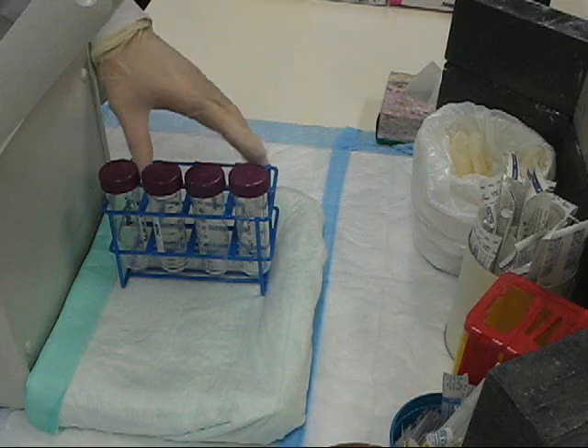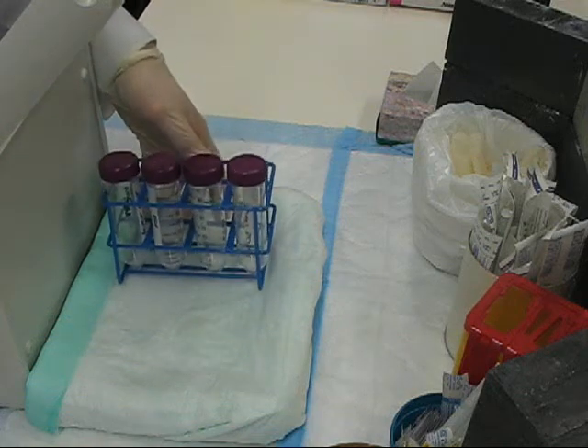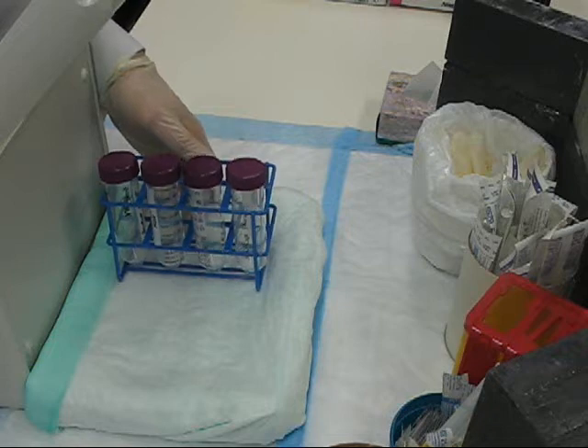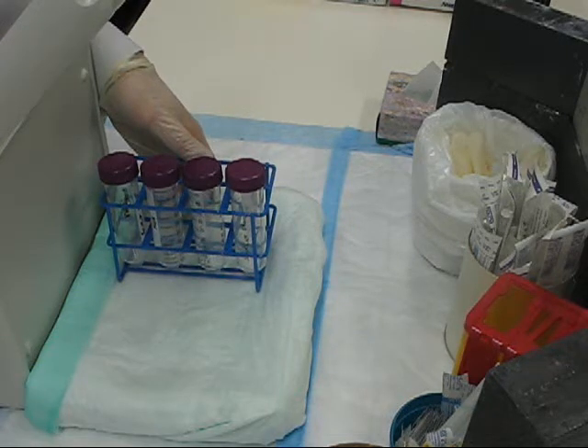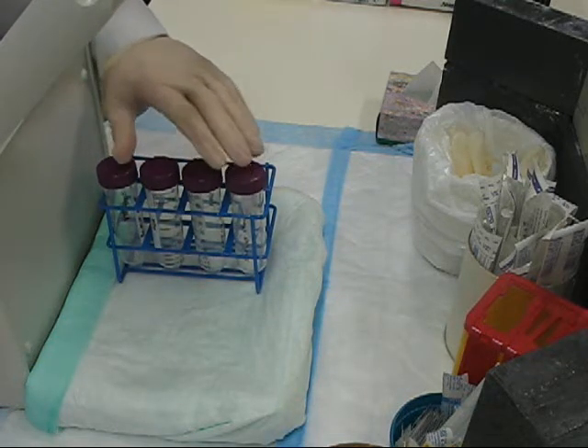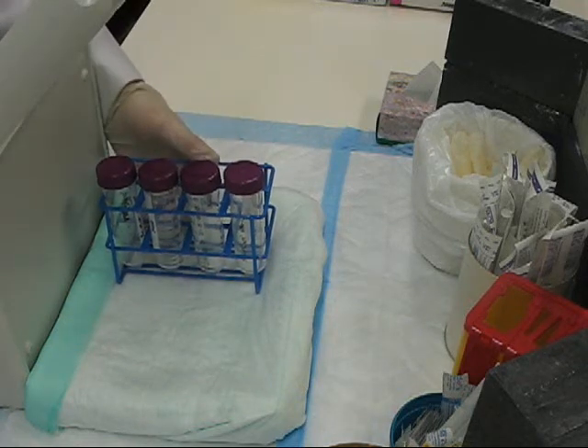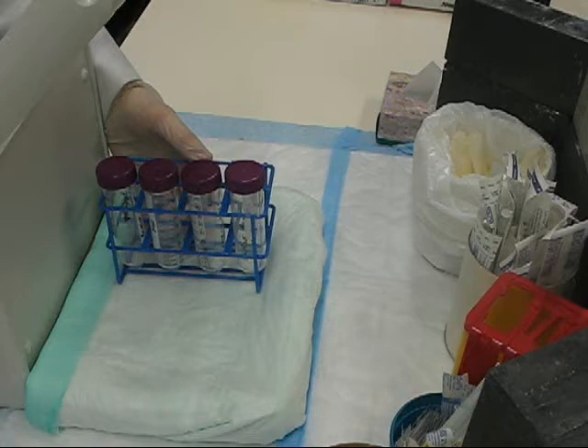When you count the tubes, be sure to count for approximately 30 seconds to ensure that at least 10,000 counts are acquired for the bound segment of the radiopharmaceutical. This gives you good statistics when you're calculating your percent labeling or percent impurity.